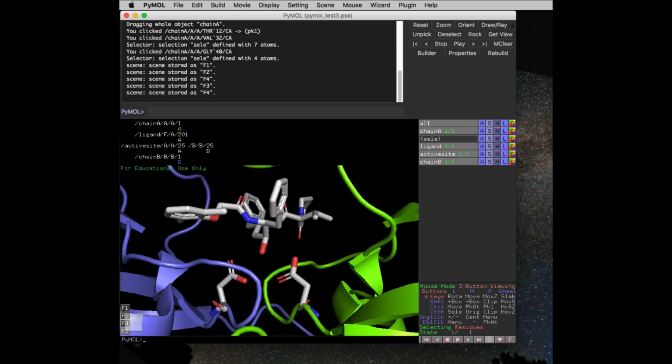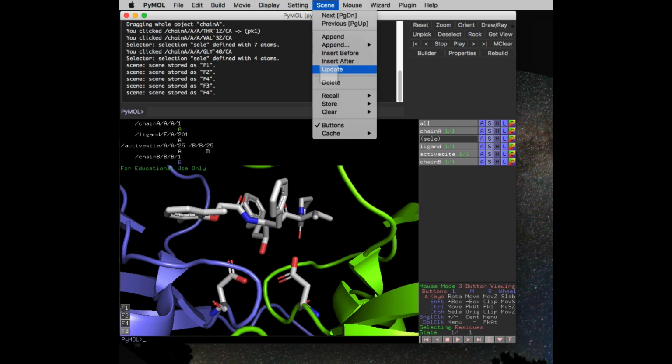Yeah, I think I'm going to have to reset my frames. So I'll clear a frame.